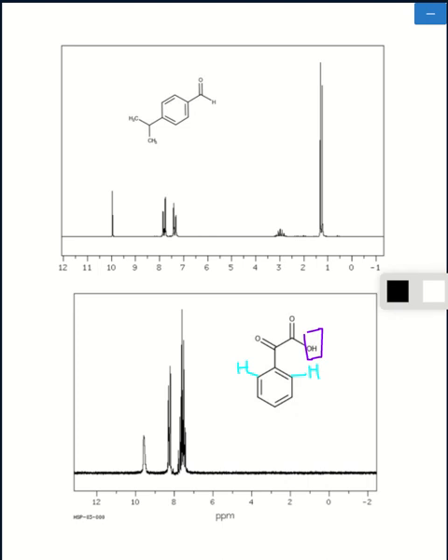And then these 3 hydrogen connected to these 3 carbon right here are suitably far enough away from the large substituent that has multiple carbonyl bonds that effectively the 3 hydrogen on these 3 carbon would show up as 1 unique peak, as an overlap.